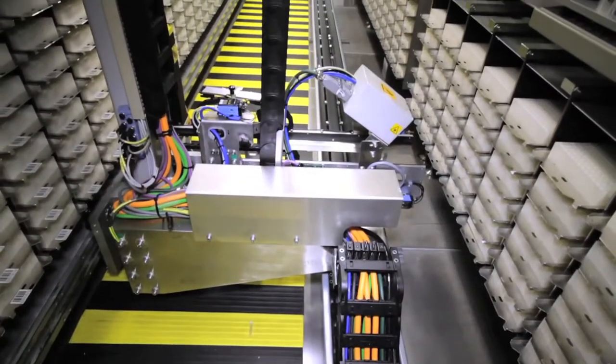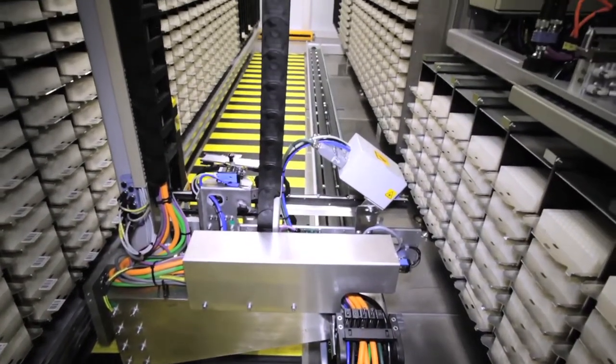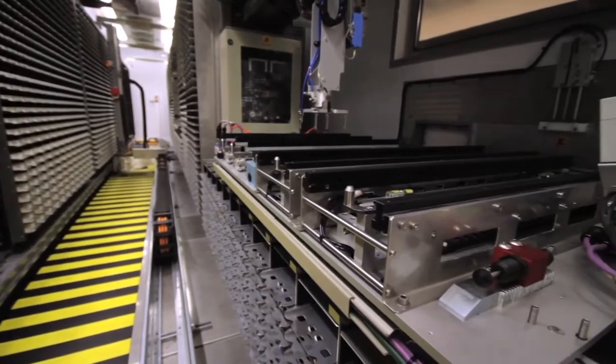The storage system utilizes computerization and robotics to optimize the transfer, storage, retrieval and thawing process.